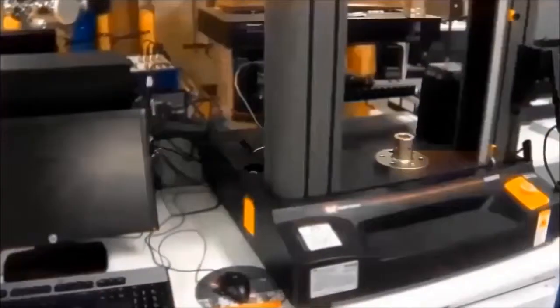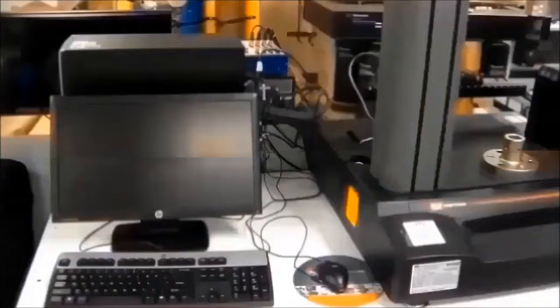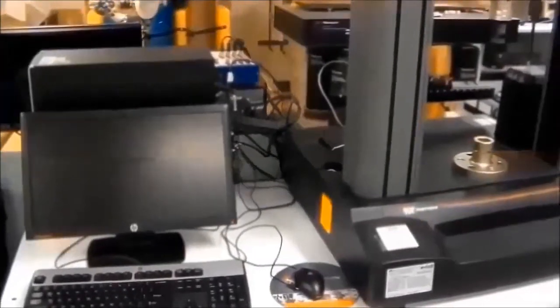This is the instrument machine, this is the frame, and this is the desktop that is connected with the frame to write a test, run the test, and analyze and extract the data that we have tested.